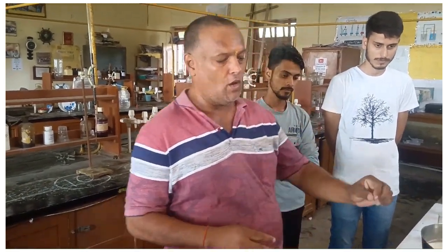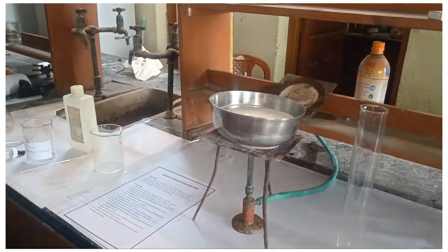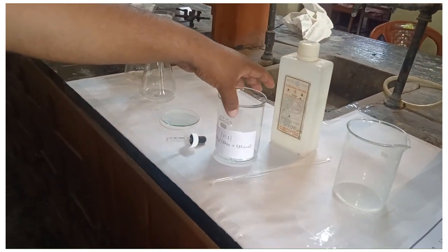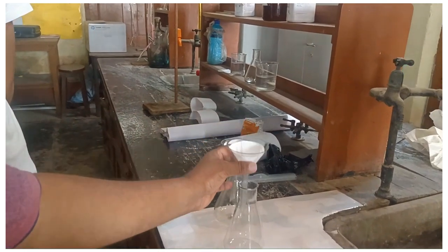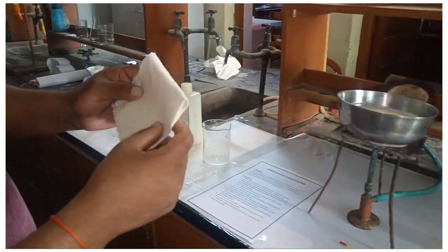First of all, we have taken half a liter of milk. The other chemicals required are acetic acid, and a diethyl ether and ethanol mixture in the ratio of 1:1. And this is a filter paper, or we are using this muslin cloth for squeezing and other things.